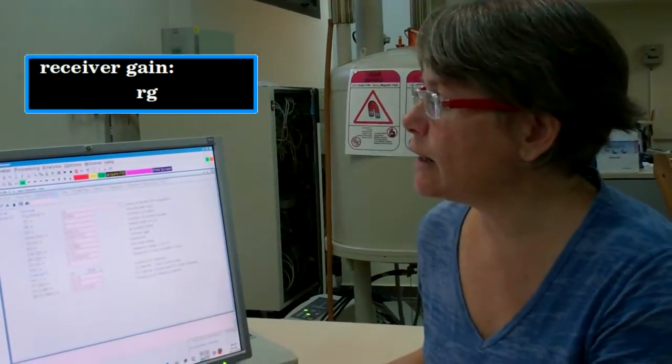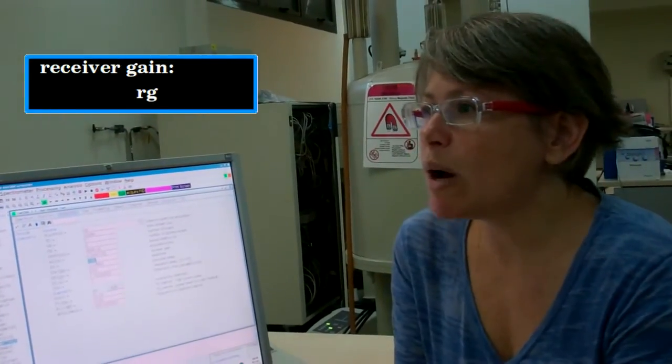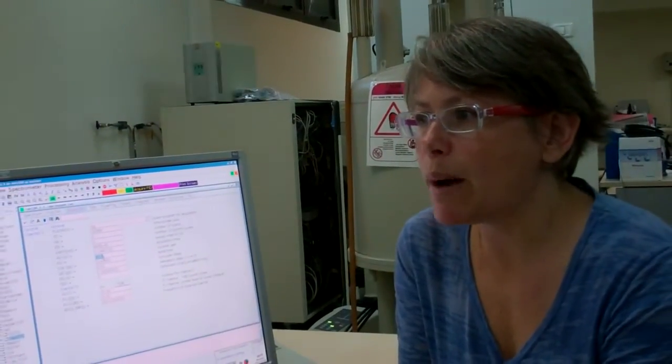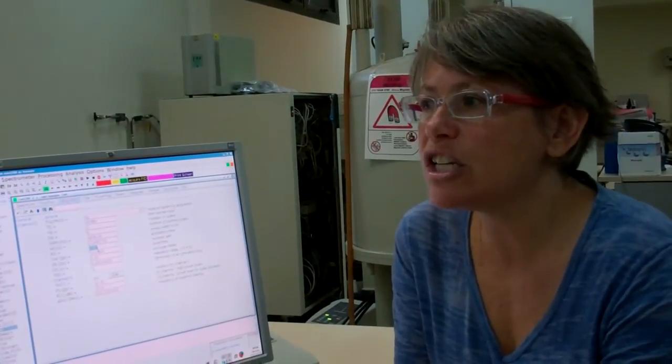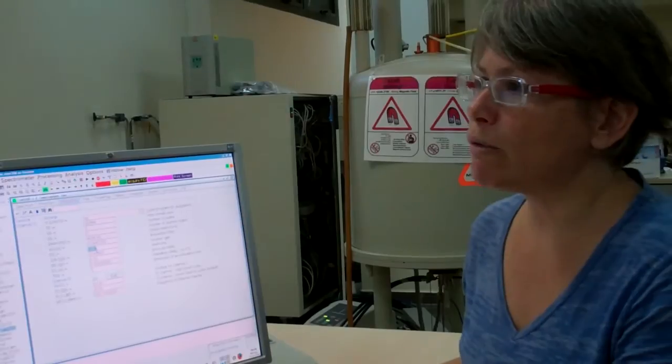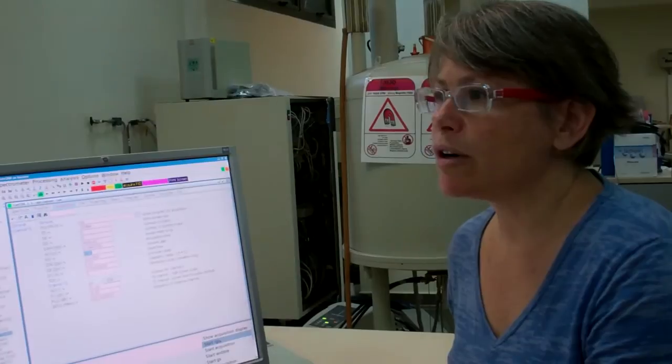The receiver gain is how much to amplify the signal before digitizing it. The spectrometer will automatically determine the optimal receiver gain experimentally with the command RGA. We'll right-click on the Acquisition Information window and choose Start RGA.